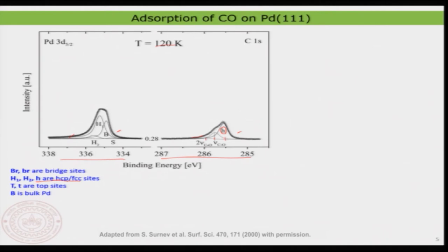You recollect this that we have already discussed. And in this paper, particularly, they have basically used capital H for the palladium resonances and the small h for the carbon resonance. Now, you see that the major peak they are actually assigning to the carbon adsorbing on the HCP site. Well, that is the most important thing for us right now. The other peaks are unimportant, but I just want to mention what it is.